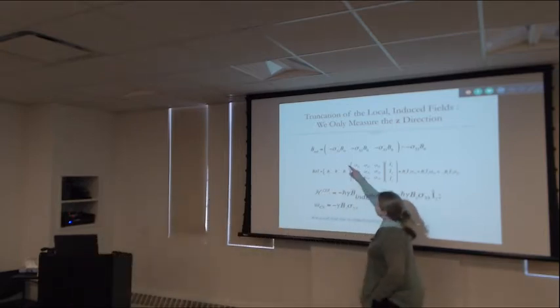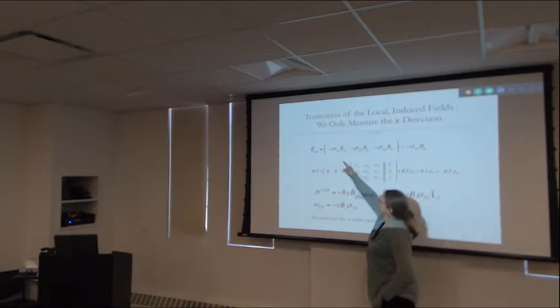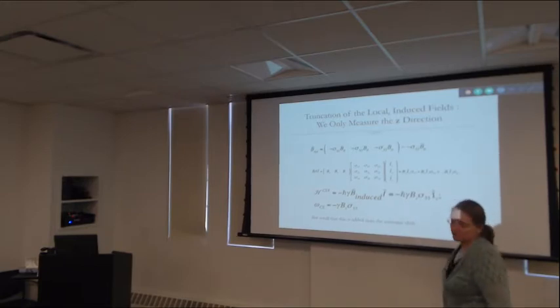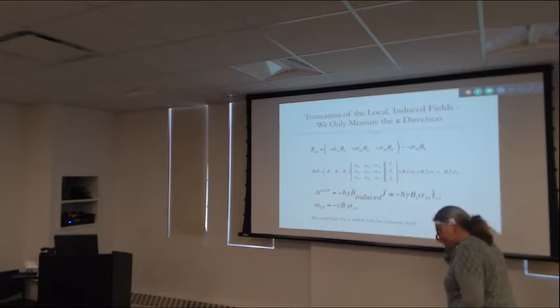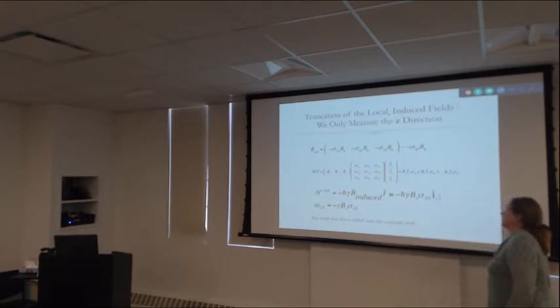Now, the induced field, so far, this is how far we got in the problem, it is along X, Y, and Z, the induced field. It's of order a few parts per million of the main field, maybe 100. If you're dealing with fluorine or some heavy metal, maybe 1,000. If you're dealing with carbon, maybe 100. If you're dealing with protons, maybe 10 parts per million. Just like the isotropic shift, similar order of magnitude, okay? What you're used to seeing in spectroscopy.